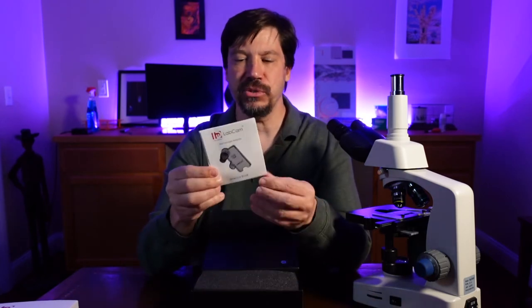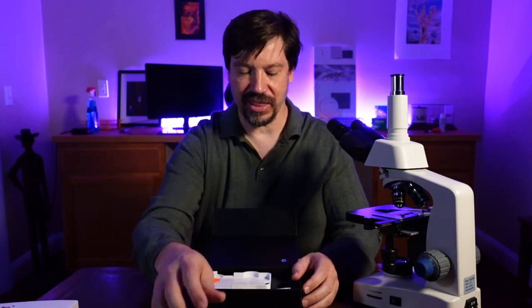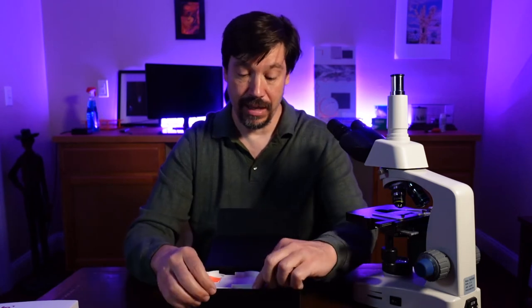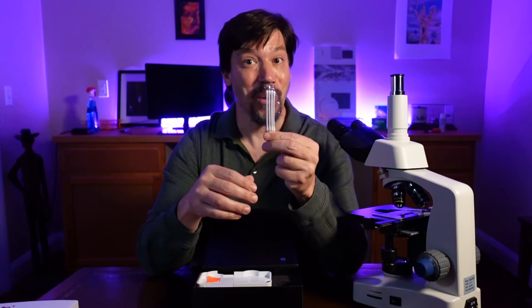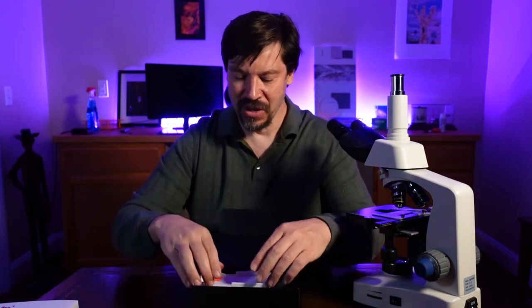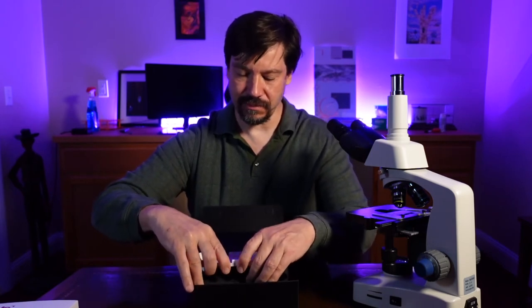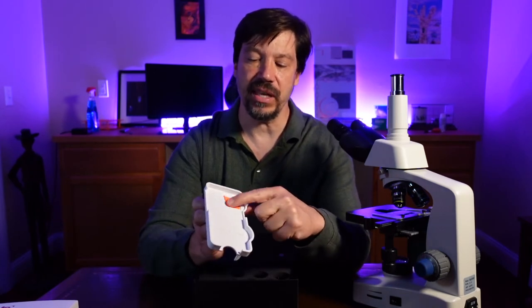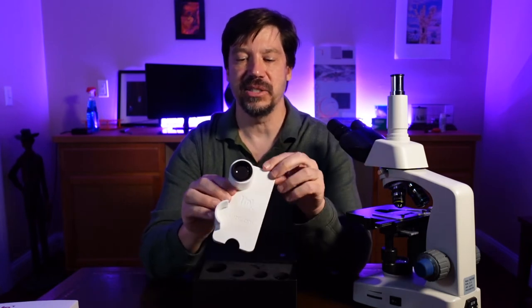We get a little user's manual — very small. And now we uncover things: we have of course the silica gel — don't eat that — and we also get four q-tips for cleaning, which is a really nice touch. We have the LabCam itself, nice and secure in the packaging. There's a little piece of tape over the inside so that nothing gets into the lens, because this has a lens to it.